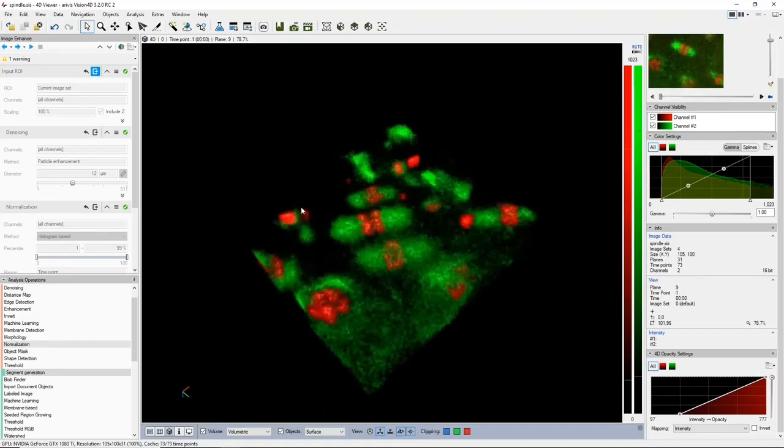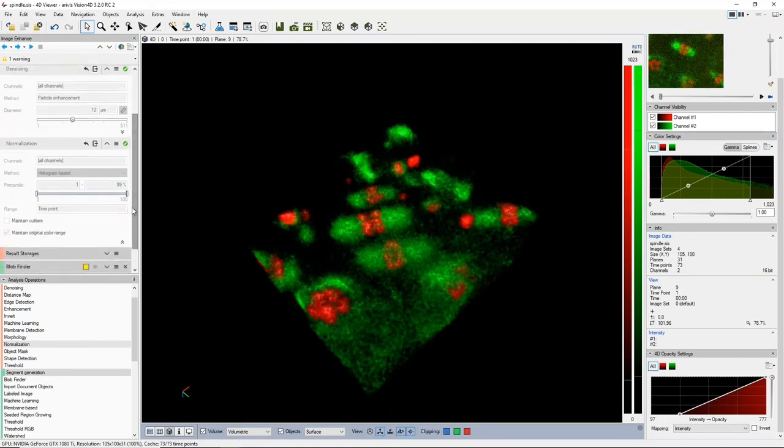So this normalization, as I said, is great for being able to set constant thresholds. It's absolutely perfect if you're doing batch analysis, and you know, try it out. There's a lot more to it than what we're able to convey in a 45 minute webinar. But we can't wait to put this into your hands again, like everything else.